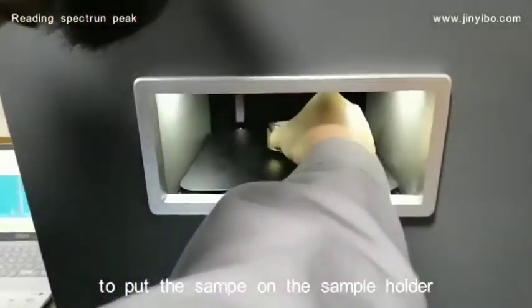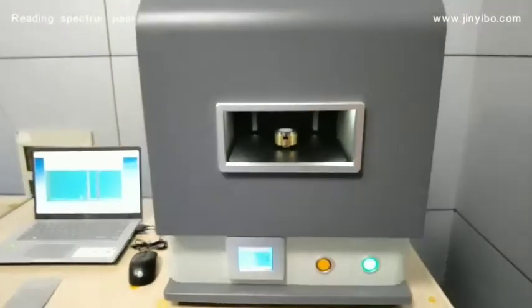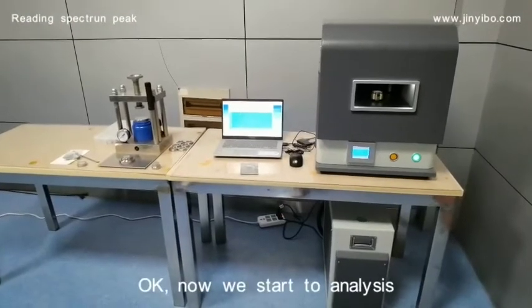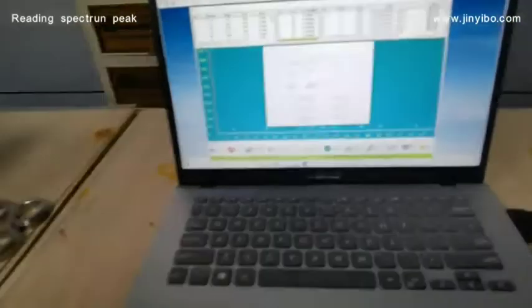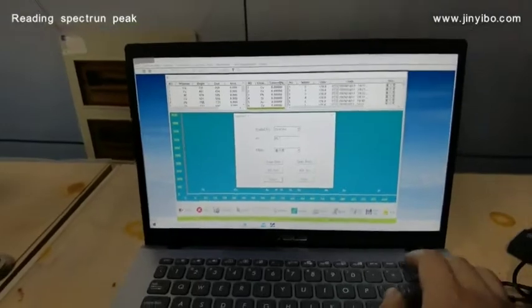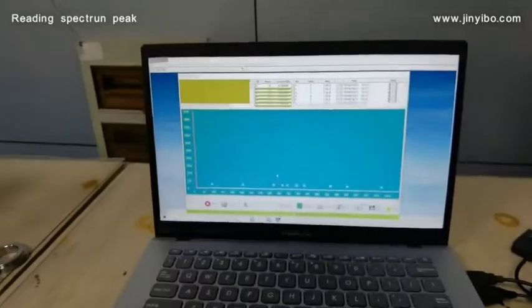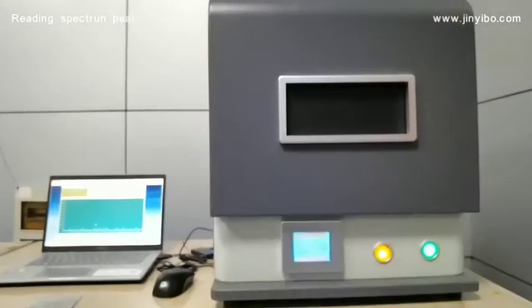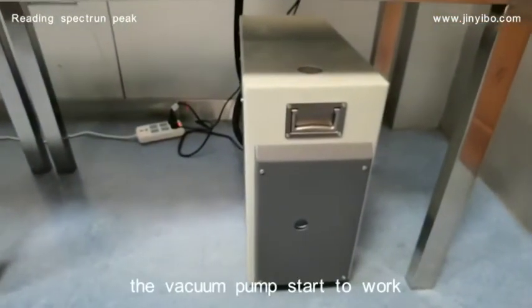Put the sample on the sample holder. Now we start to analyze. So, we start to work.